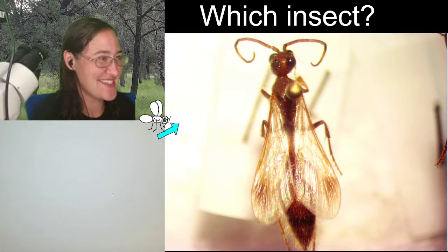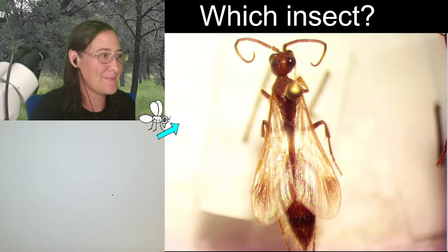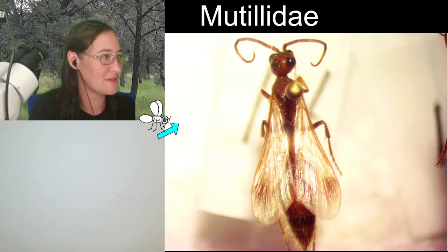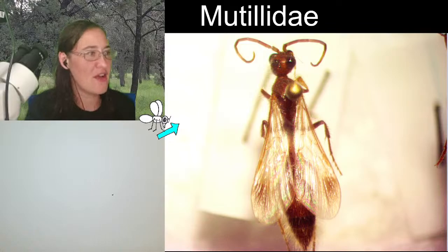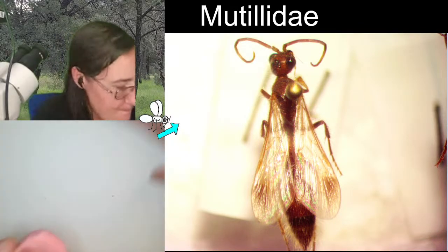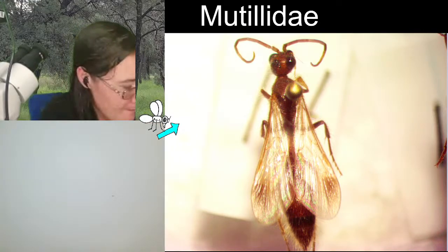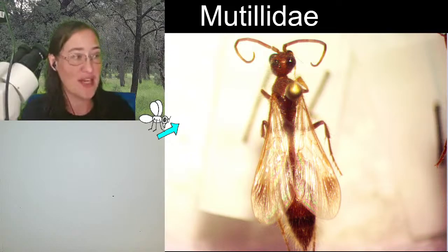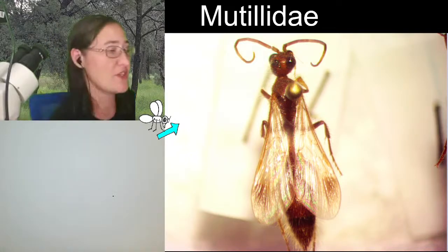Sounds like a plan. I'm thinking we do the mutillid. Alright, so, I don't know identification on this velvet ant, past family level.